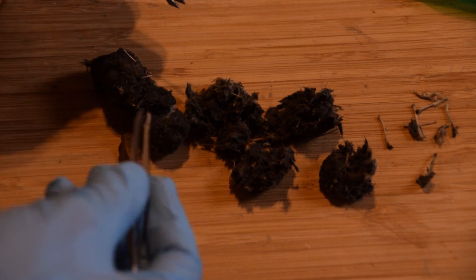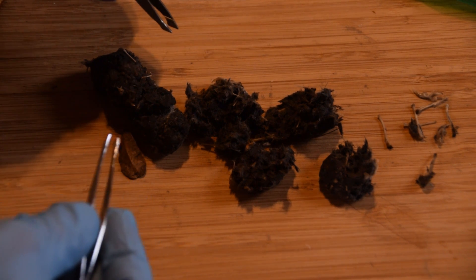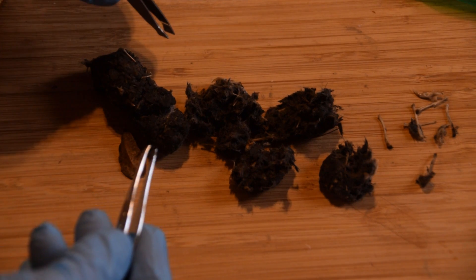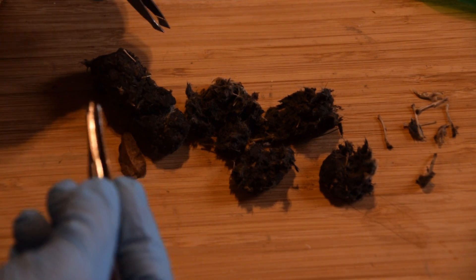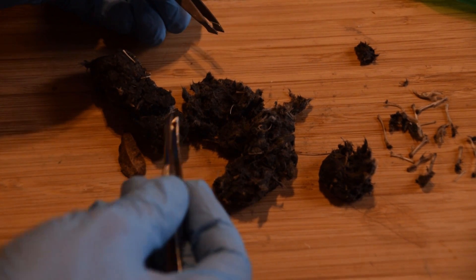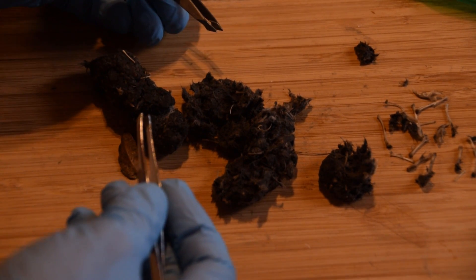With all the fur and the size of these bones, I'm assuming this is probably a whole bunch of different mice that this owl has eaten and then regurgitated. As I dig into it, I can hear it making all kinds of squishy noises.